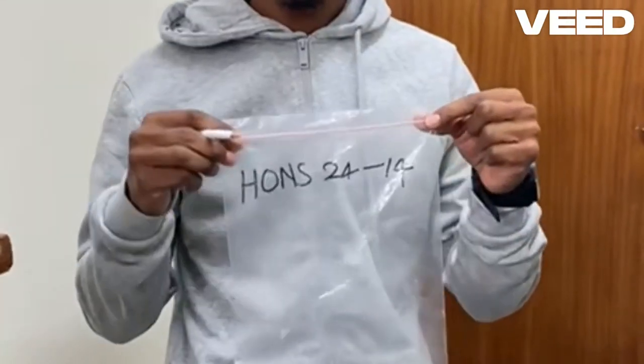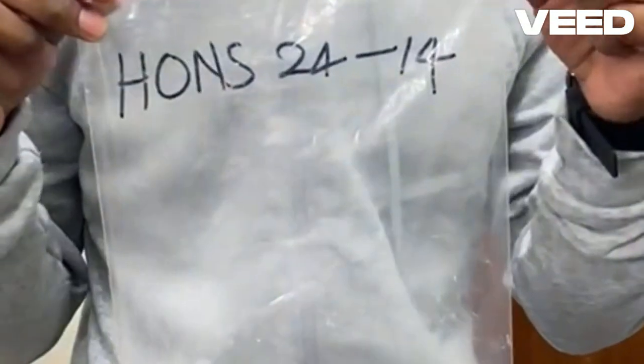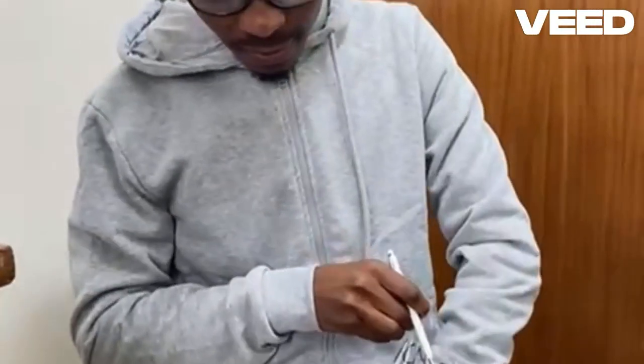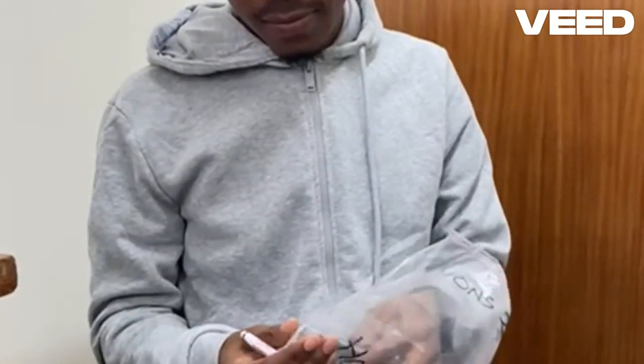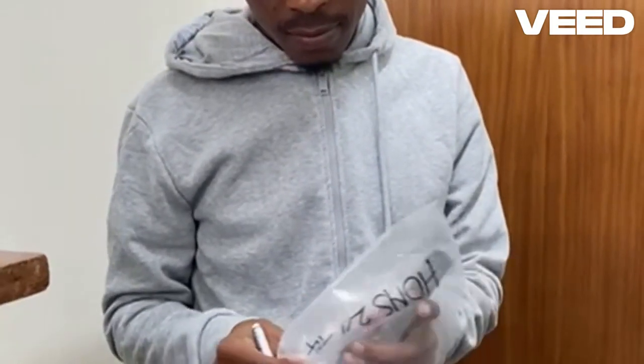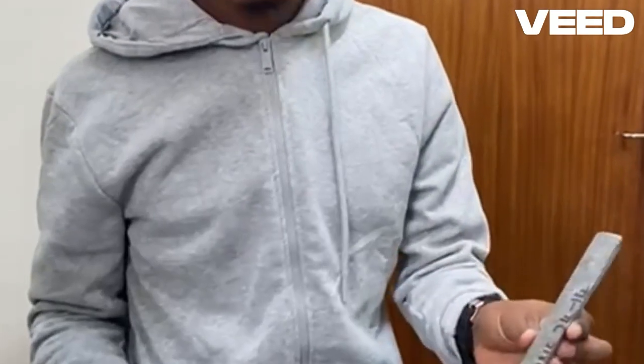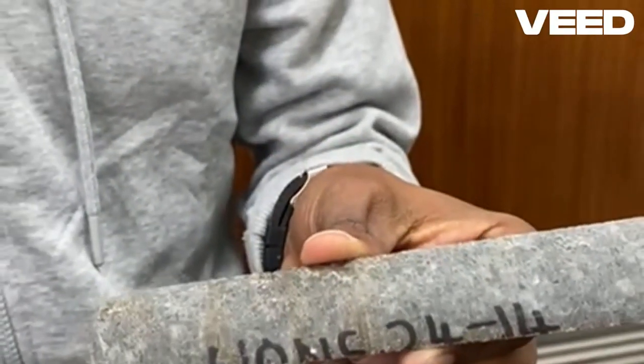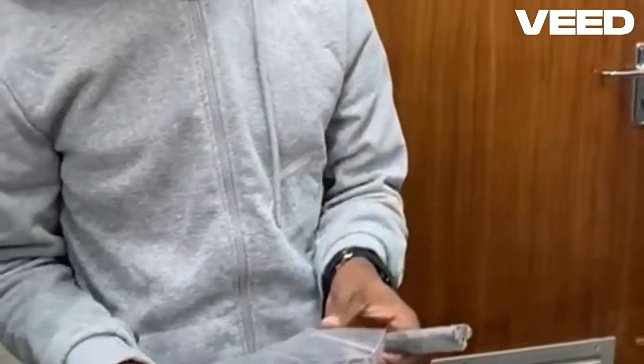Labeling samples allows for easy identification and tracking throughout the comminution process. Each sample may have unique characteristics or origins that need to be documented for further analysis and interpretation. Proper labeling helps ensure that the correct samples are processed and analyzed. It helps prevent mix-ups or errors in sample handling, which could lead to inaccurate results or data loss.